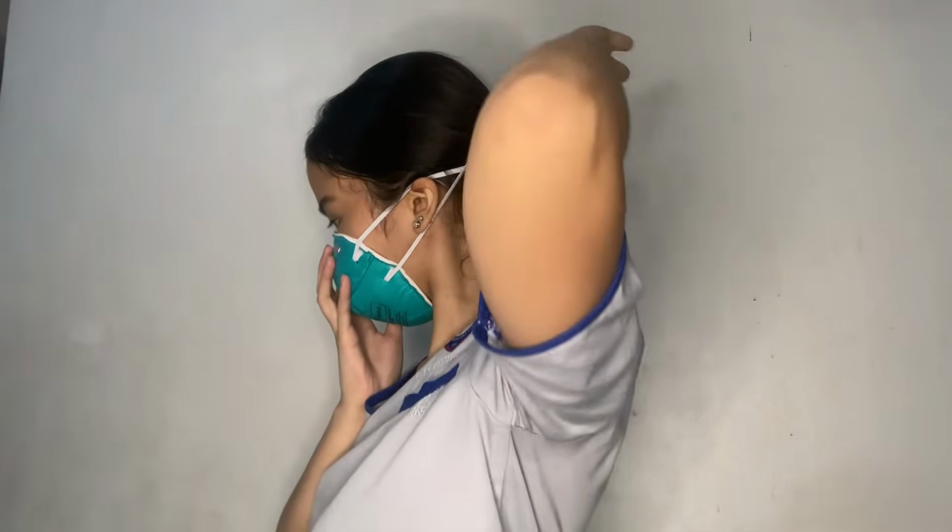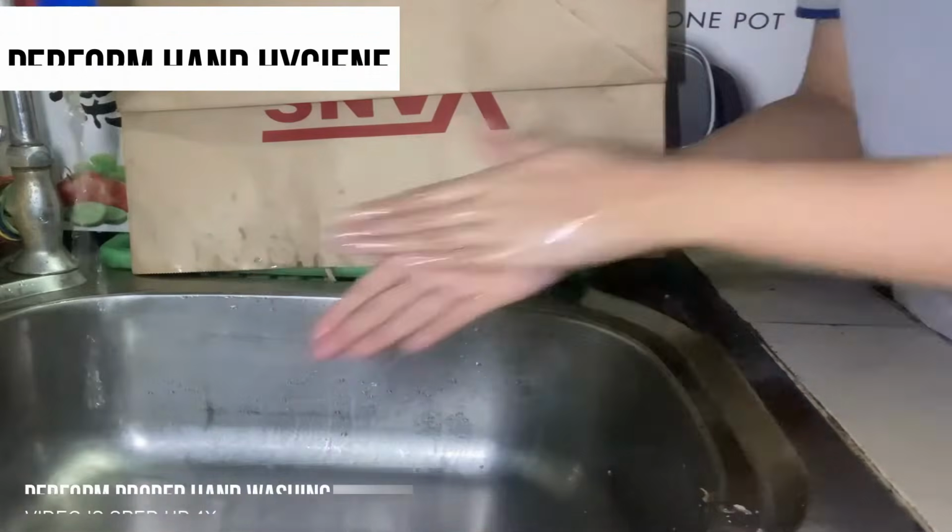We're now going to remove our N95 respirator. The bottom elastic bands should be lifted over the head first. Lift the remaining top bands over the head away from the face, and then dispose of it in the yellow bin.